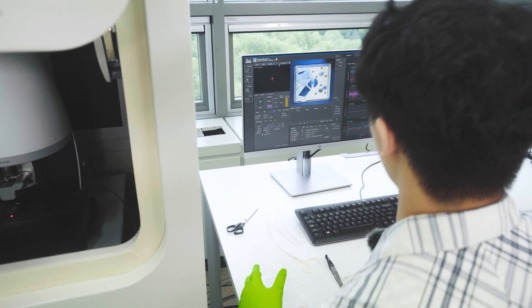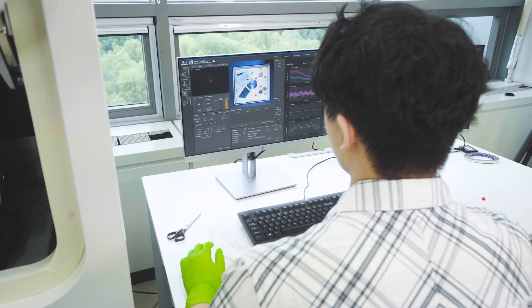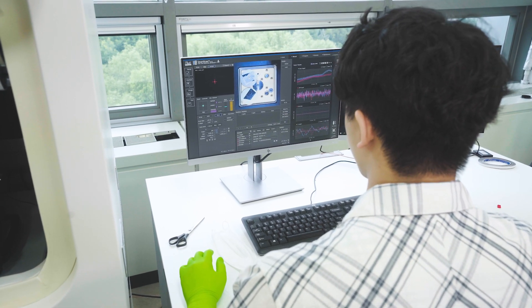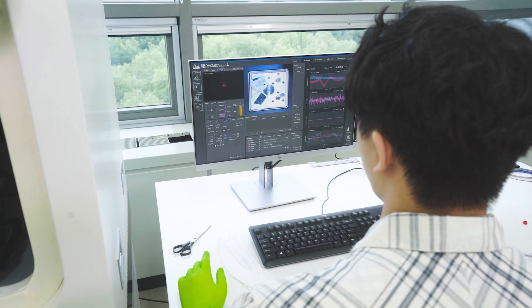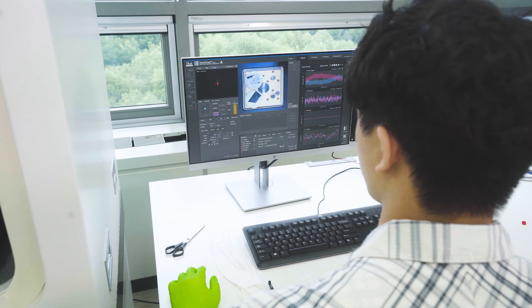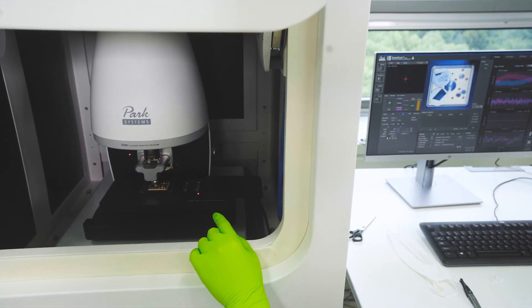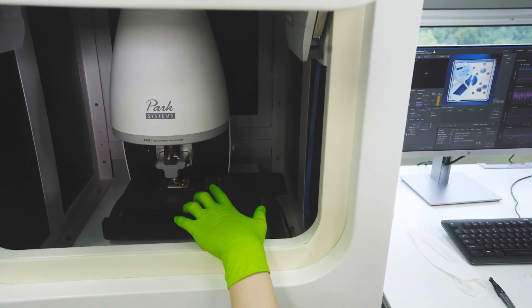Now we just need to move the probe hand over the sample — move to center like this, and then press go to. And we can see here that the position is now over the sample.